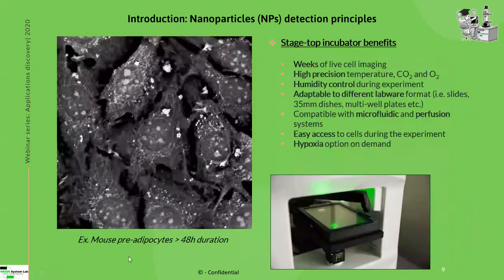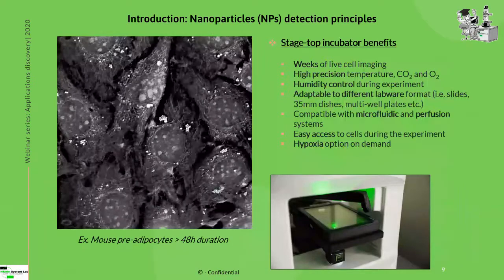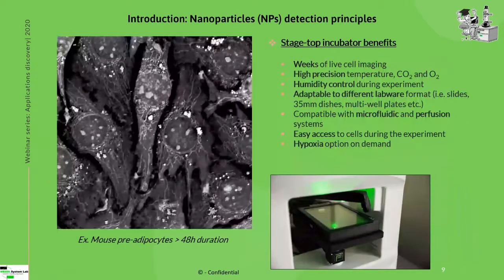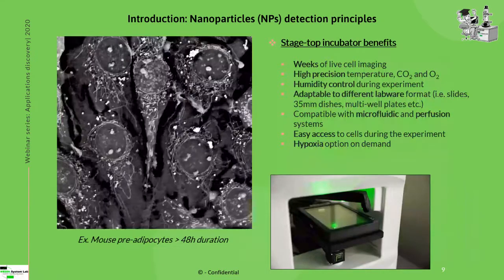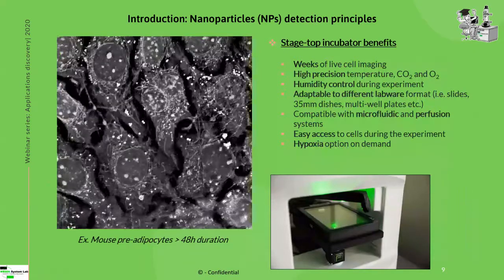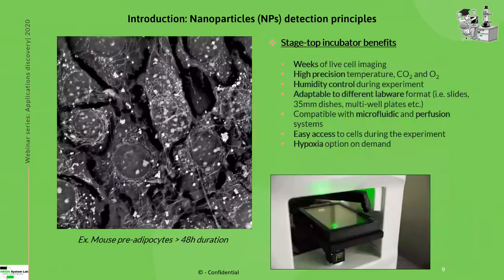Moreover, as you may know, nanoparticle studies are quite long sometimes. Nanoparticles can take hours to start to interact with the cells, even days to start to penetrate into the cells. So in this kind of study, it's very good to have continuous monitoring and to be able to follow the cells for a long period of time.